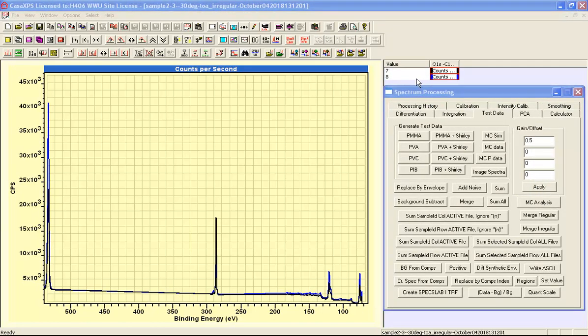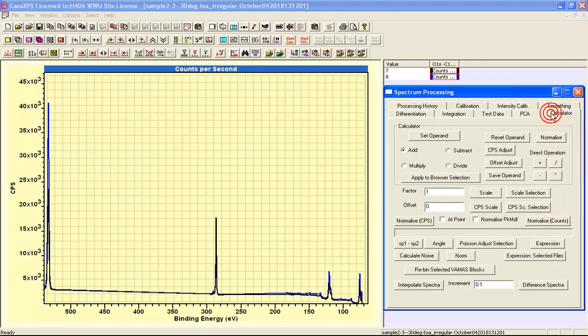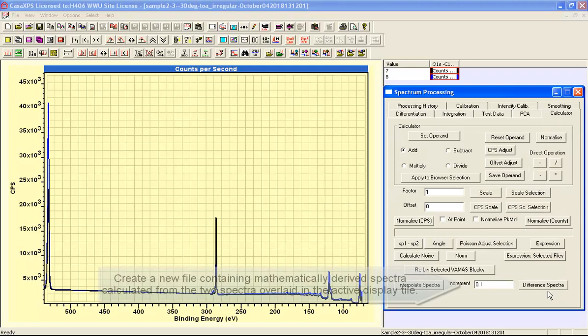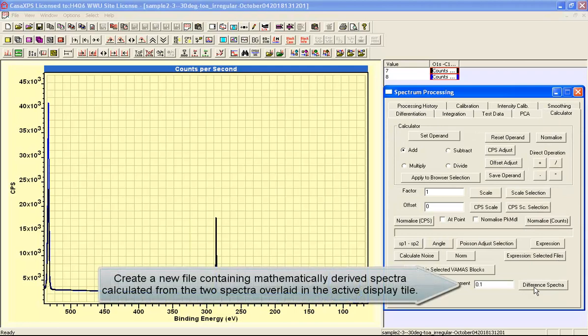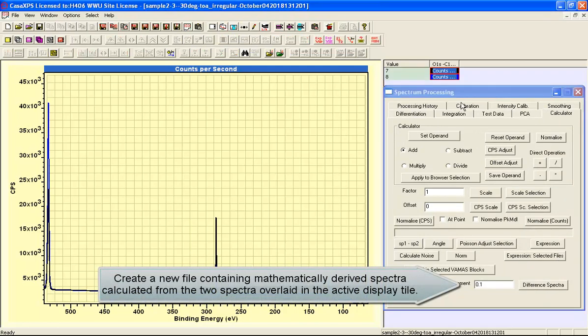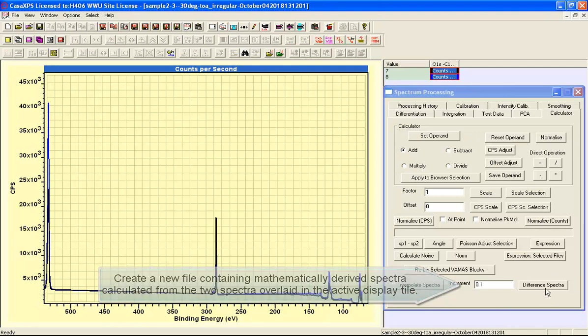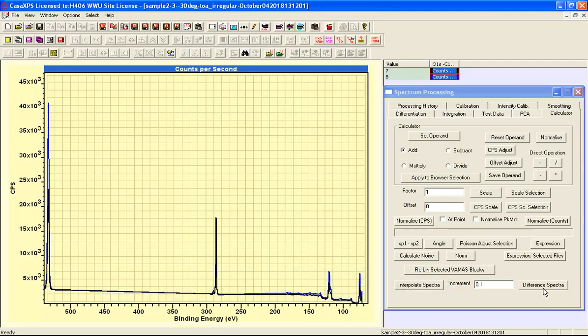Once we've created a pair of VAMAS blocks such as these where the data are now merged to form these single VAMAS blocks out of multiple spectra, we can then apply the same procedure as was performed for the survey data. That is to say, if we overlay these two spectra in the active tile and then press the difference spectra button, we will create a new file that gives us a sequence of spectra that provide insight into how these two spectra merge from one to the other.